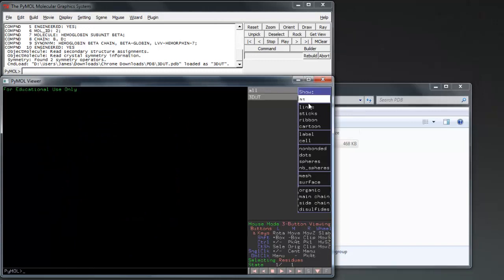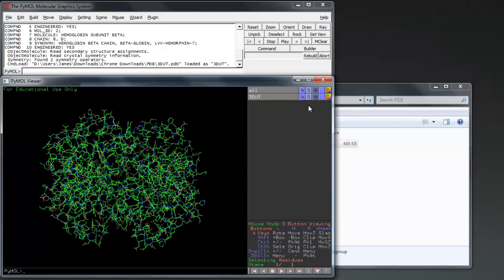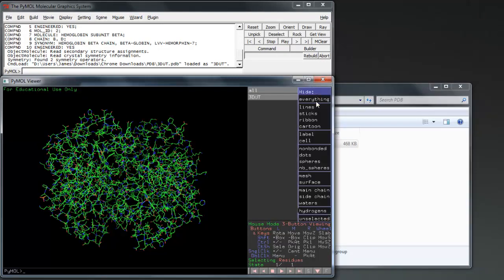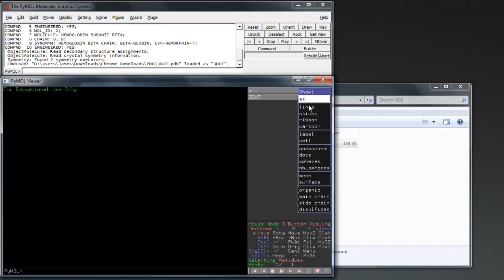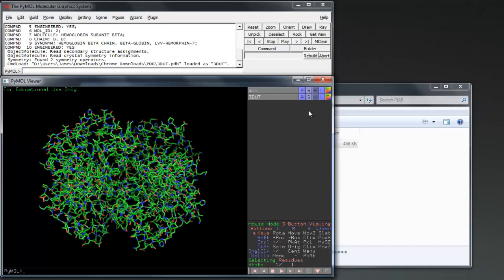We are now going to use the Show option to decide on the core of our protein. Lines is the most basic, showing any atoms and bonds, while Sticks is the slightly larger, more descriptive version.